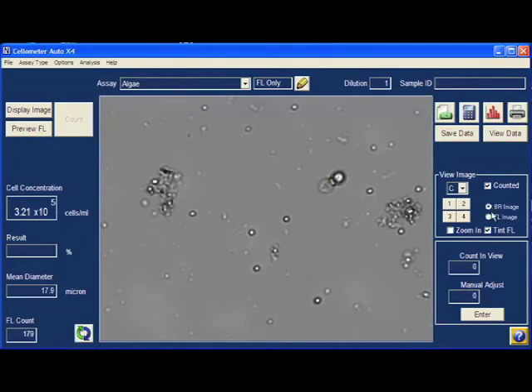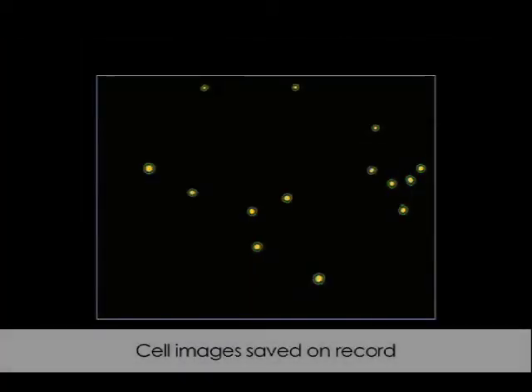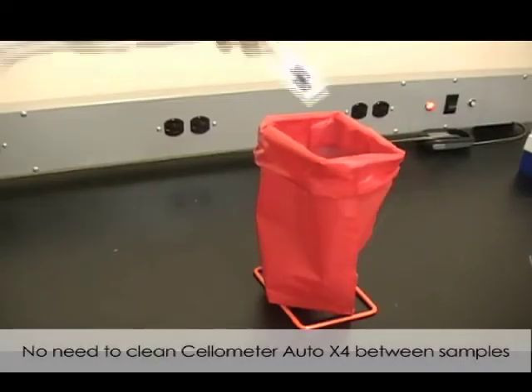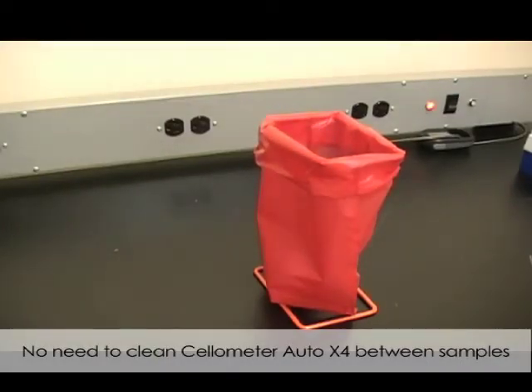Cell images are saved as a record for each sample. They can also be used to reanalyze your data. Counted algae cells are indicated by outlines for confirmation. The all-plastic counting chamber is easily disposable after use.